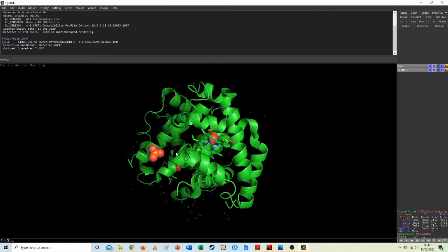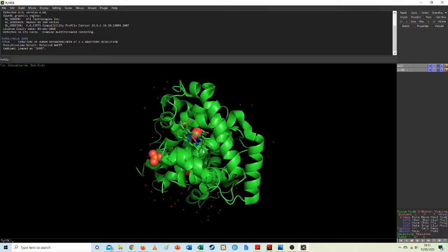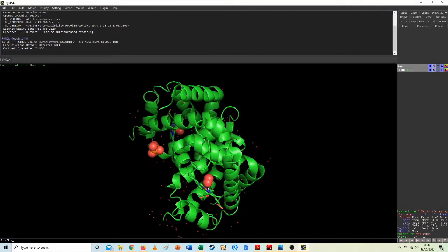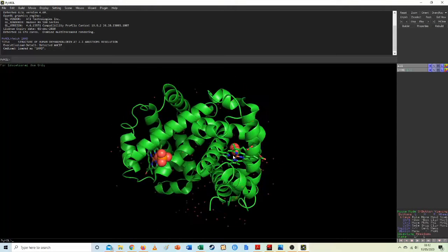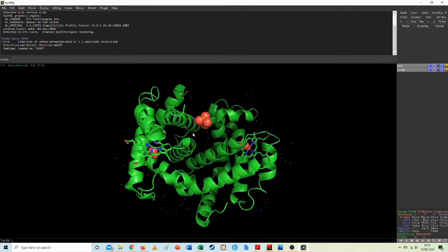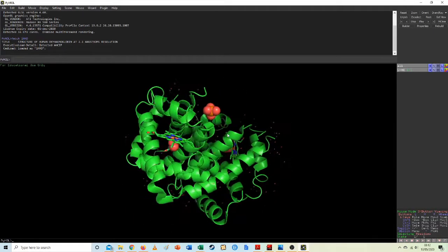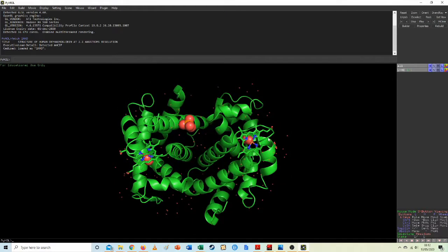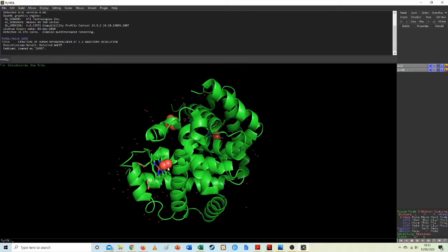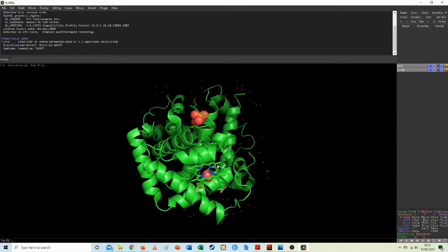There's something very interesting there that to me looks maybe like our iron ligand with our diatomic oxygen attached. What the hell that is, I don't know. That thing floating in the air, not sure what that is. We might have to do a little bit of further reading. But certainly to me, that looks like our oxyhemoglobin complex, and we've got another one over here.